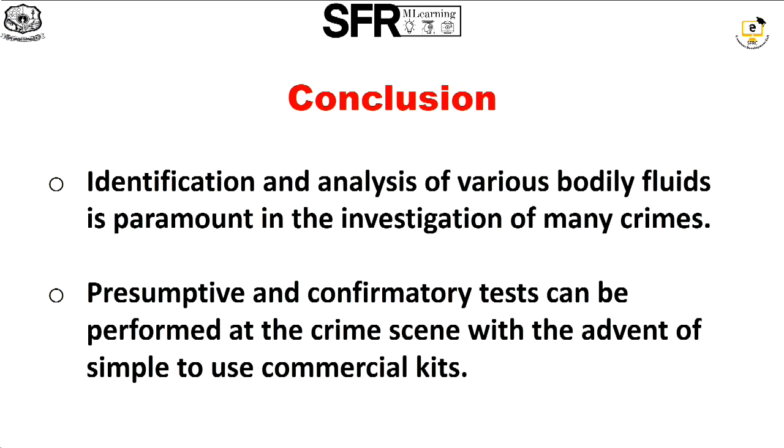Conclusion. Identification and analysis of various bodily fluids is paramount in the investigation of many crimes. Presumptive and confirmatory tests can be performed at the crime scenes with the advent of simple to use commercial kits.